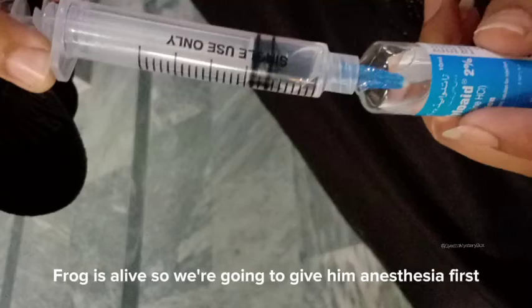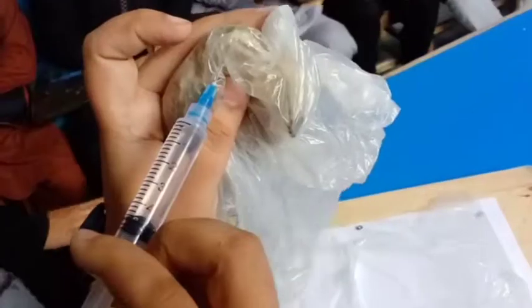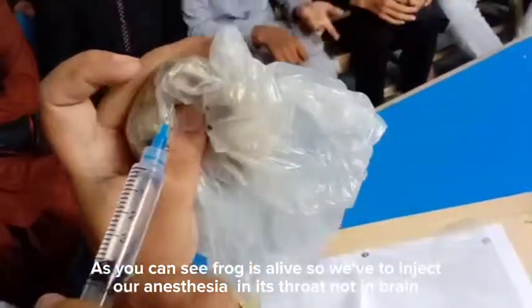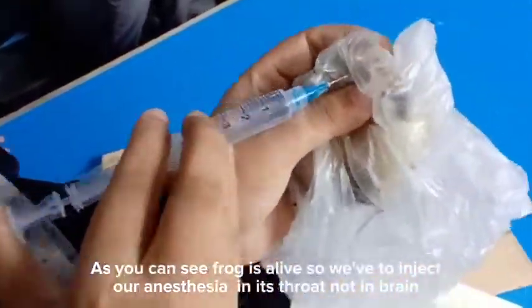Frog is alive, so we're going to give him anesthesia first. Frog is alive, so we have to inject our anesthesia in its throat, not in the brain.